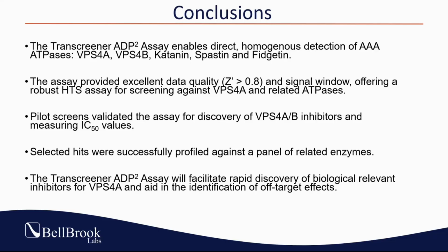Pilot screens that we did in that manner identified inhibitors for VPS4A and VPS4B that are new inhibitors, and we determined IC50 values for them. We profiled those hits against those other AAA ATPases that I mentioned at the top.